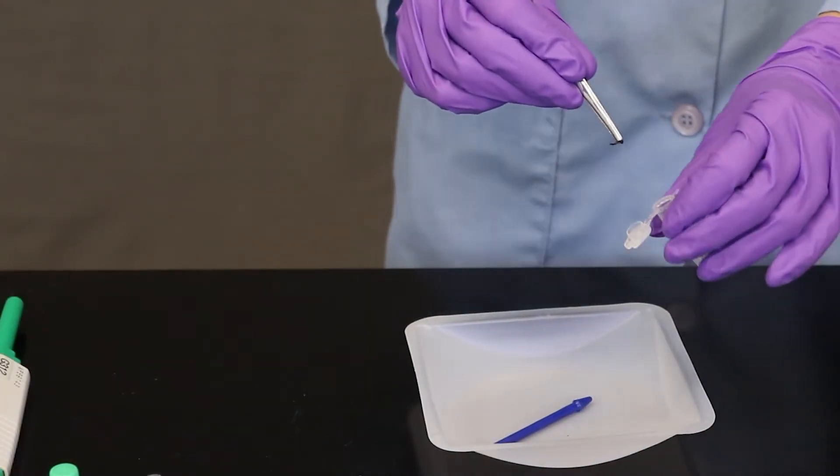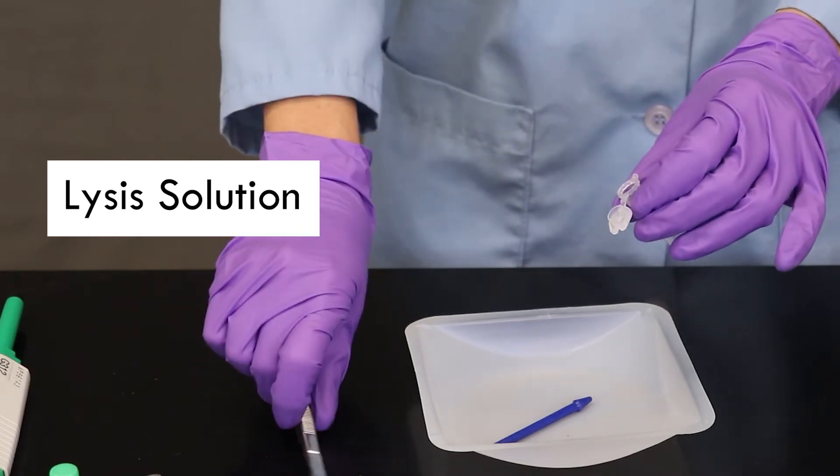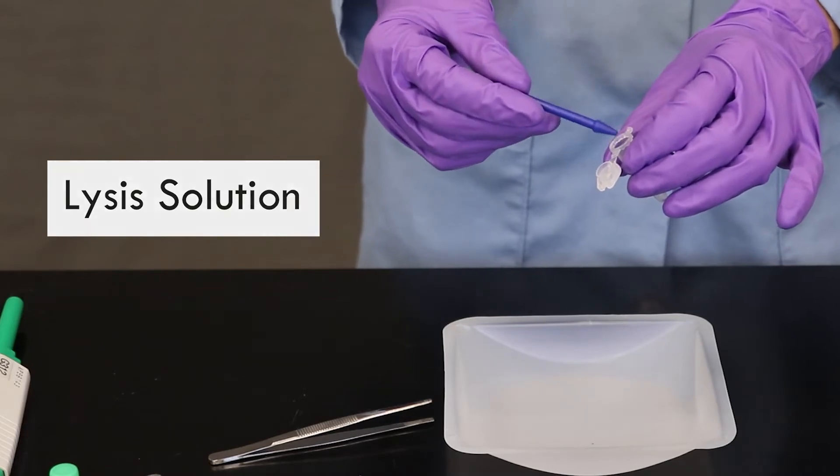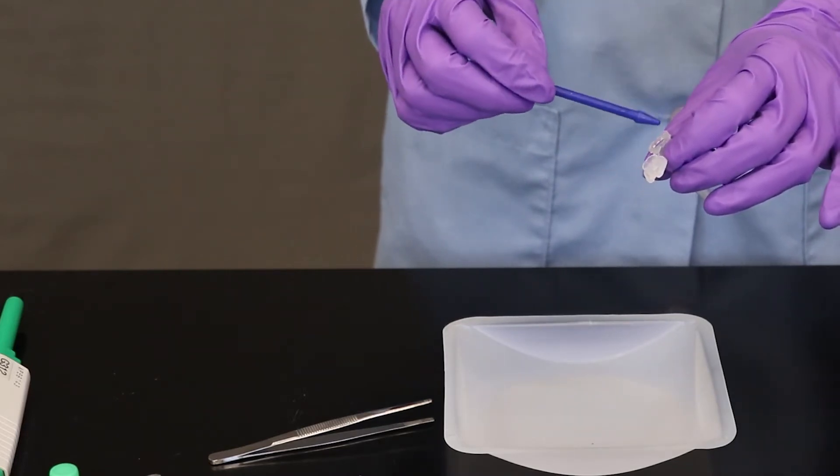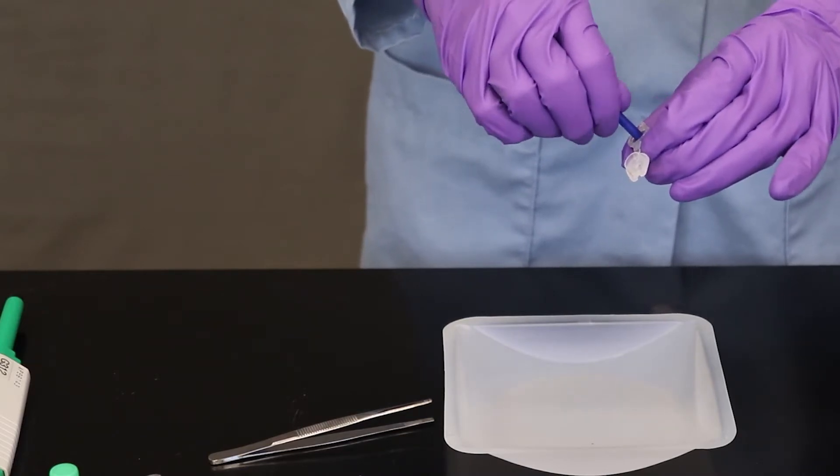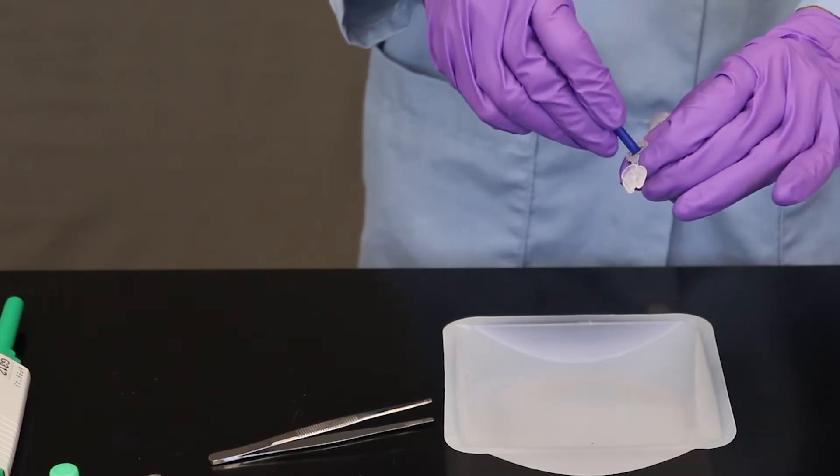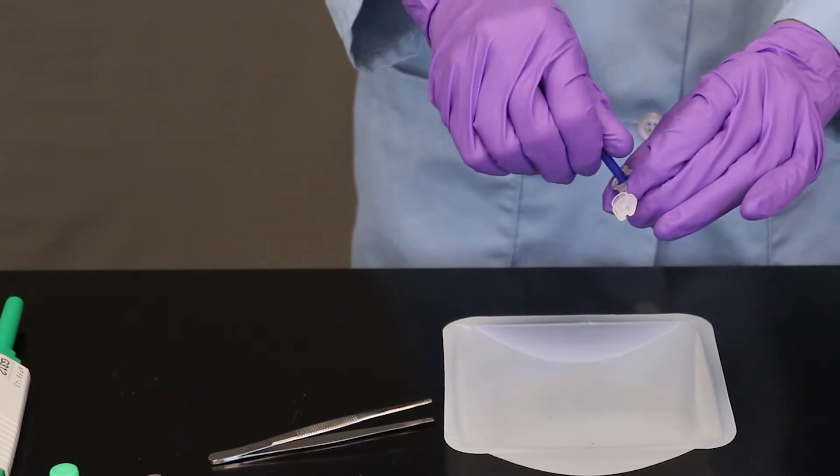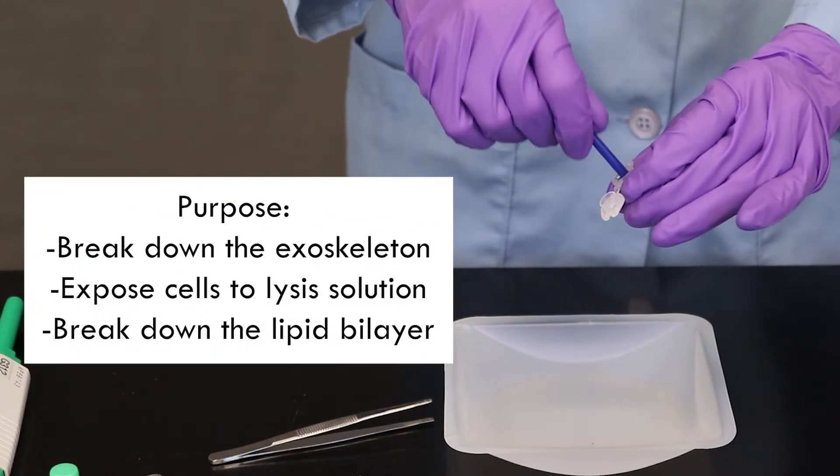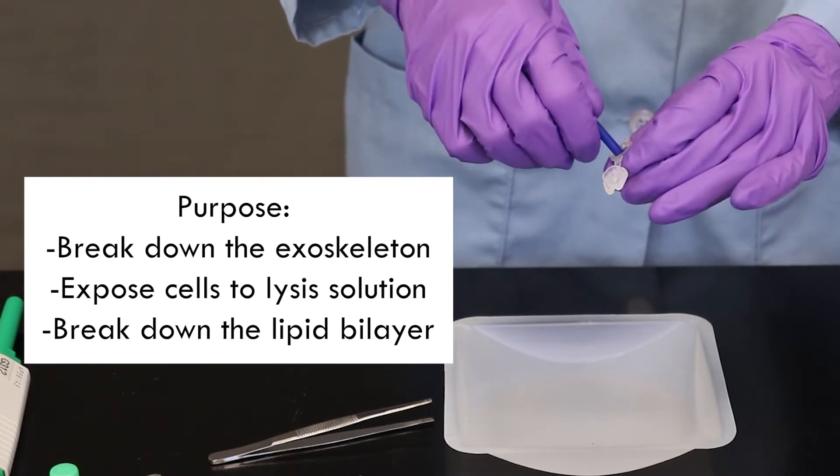So here I have an insect leg and I'm adding it to the lysis solution. I have 180 microliters of lysis solution in this microfuge tube. And I'm going to use this small pestle and mechanically break down the leg. So I'm going to grind the tissue a lot. I'm pushing the pestle against the bottom of the microfuge tube here and twisting.